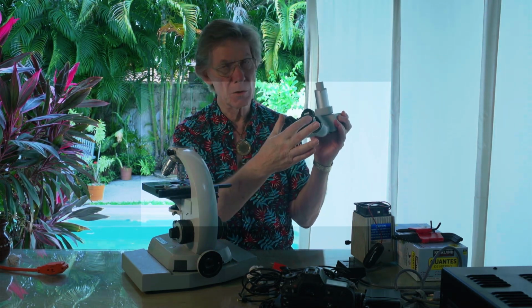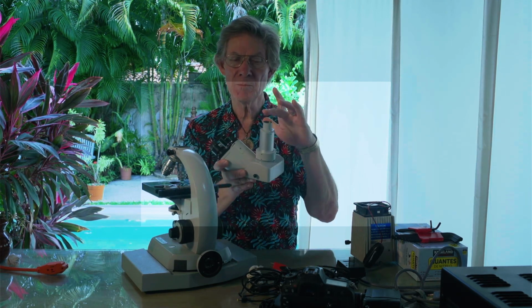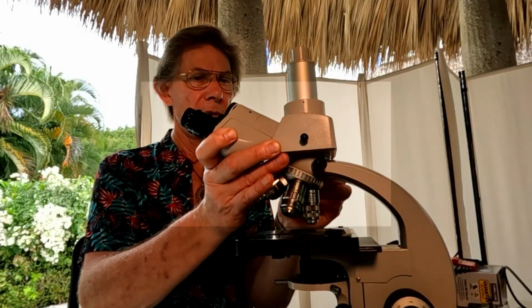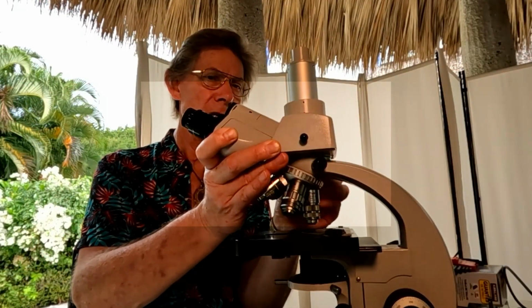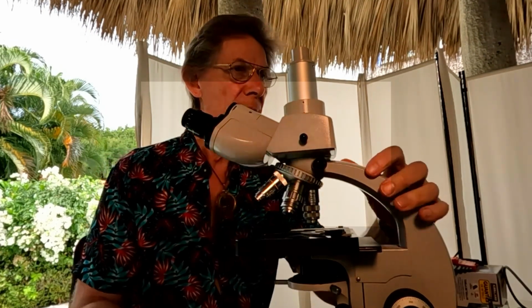Number one, it lets us look through here with our eyes to see the image. The second thing it does is it puts part of the light up into a camera so we can photograph the image in video or pictures. And we need to do that so that we can record what we find in somebody's blood. So the trinocular fits on the top of the microscope like this, and we tighten down the hook up. And now we have something that looks like a microscope.